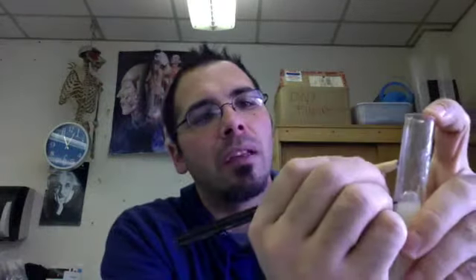See how that works on there? I've yet to find anybody that can get it in there without the air. And if you can, you've proved me wrong or supported me being wrong. You're going to do that with all 4 or 5 test tubes, whatever you want to do. So it's marked. I'm going to make this test tube 1. I'm not doing good science here by not labeling my samples.